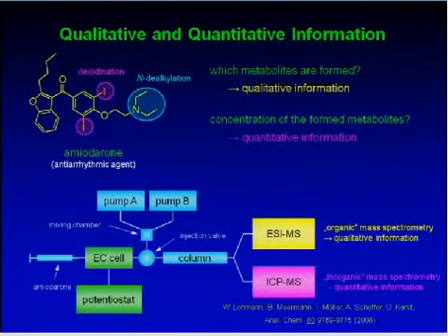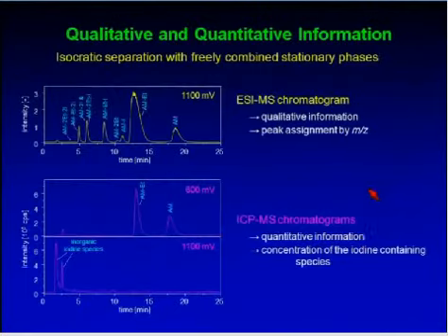In that case, ICP is very nice because ICP is completely substance independent in the quantification. Due to the fact that you are atomizing the compounds in a very hot plasma, only the atom concentration is significant, which means there is no effect by the history of the compound. For example, for a compound which has been in an organic state, you get the same signal as for an inorganic compound. It's completely different to what Philip already mentioned for the field of electrospray MS.